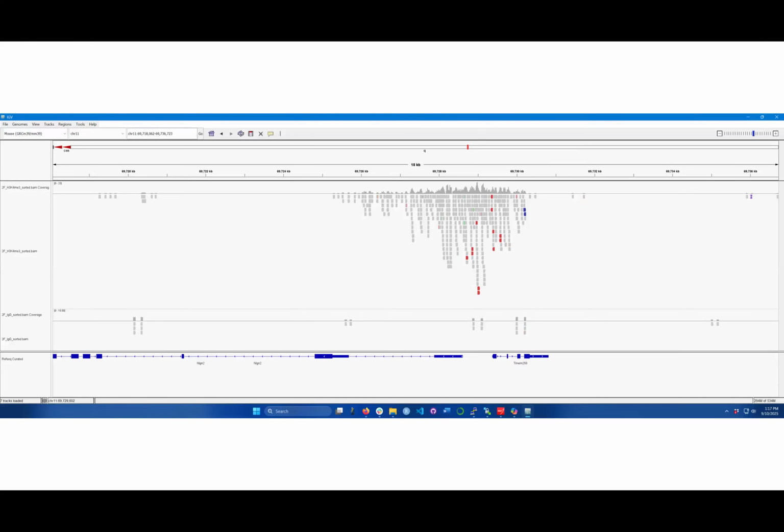Another key thing for most of these experiments, which I'm realizing is a bit small, is here on the top, I have H3K4 trimethylation again. For some reason, I switched to the gene neuroligin 2. But here on the bottom, I have an IgG control. So this is an antibody that's not going to recognize really anything in particular, and usually we'll have it for CUT&RUN or for ChIP-seq.